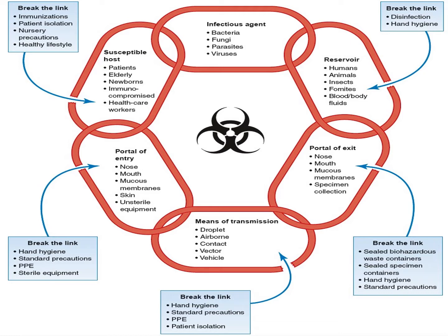And lastly, the last component of the chain of infection, which is the reservoir, could either be humans, animals, insects, fomites, and also our blood or body fluids or the specimens of our patients. So in order to break this component, we have to perform proper disinfection and also practice hand hygiene.